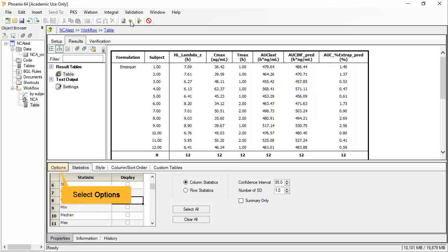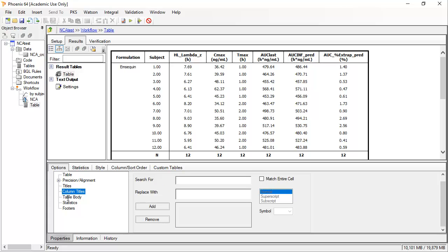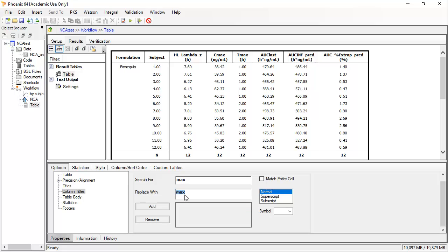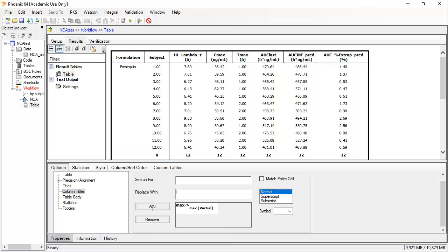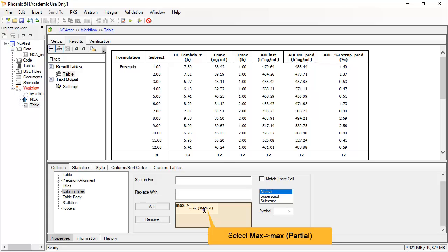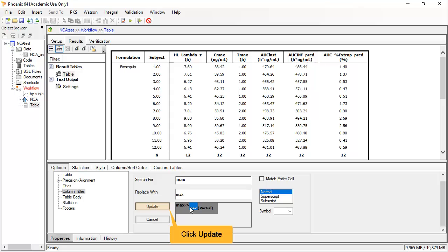Further formatting can be set under Options. For example, selecting Column Titles allows you to change text fragments or format. This will update column titles containing the word 'max' so that 'max' is subscripted upon execution. With the 8.3 release, you can now double-click if you need to edit these. Clicking Update to commit any changes.